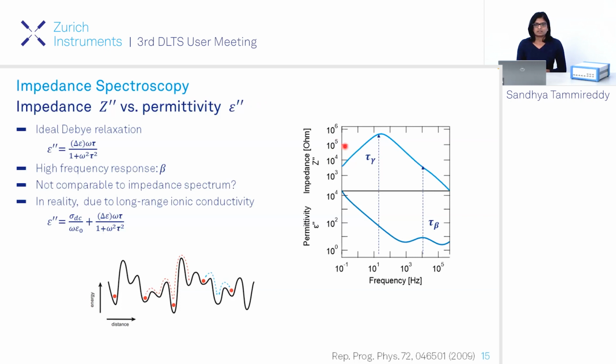But when it comes to lower frequencies, you measure over longer times, which allows the ionic defects to migrate very long distances over a series of hops. In that situation, if you have transport layers or electrodes, they would act as blocking layers for ions. Since ions can't pass through, they will pile up at the interfaces, leading to a near DC response at the low frequencies.